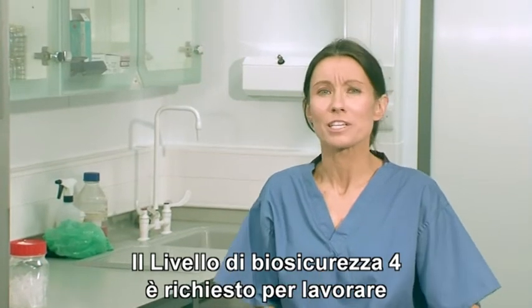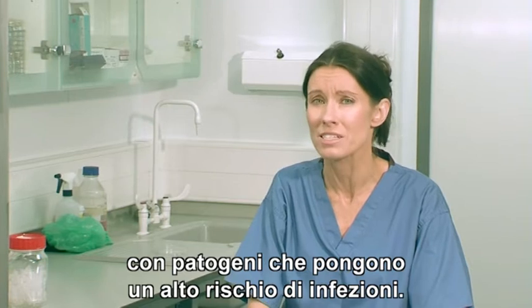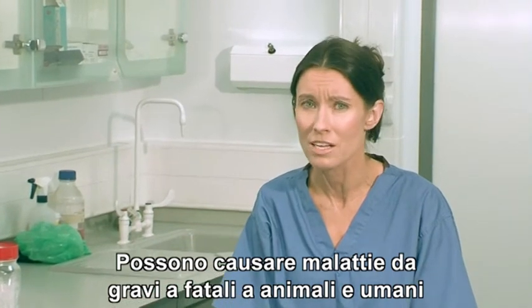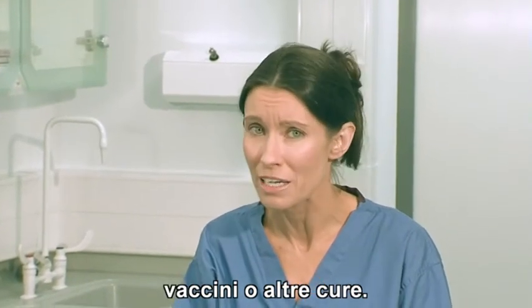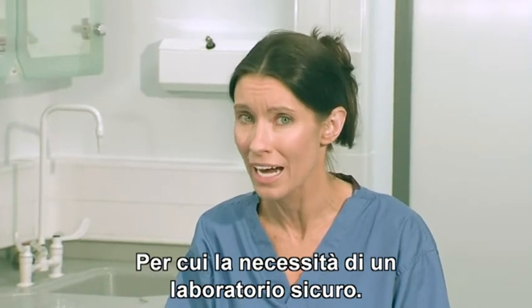Biosafety Level 4 is required for work with highly dangerous pathogens that pose a high risk of laboratory infections. They can cause severe to fatal disease in animals and humans, are likely to spread to the community, and are pathogens for which vaccines or other treatments are not available. Hence the need for a safe and secure biolab when handling these agents.